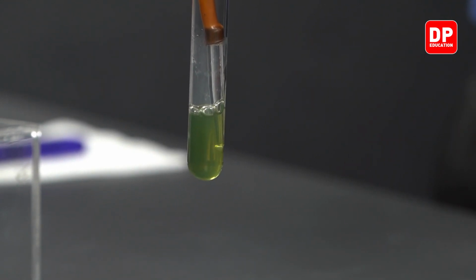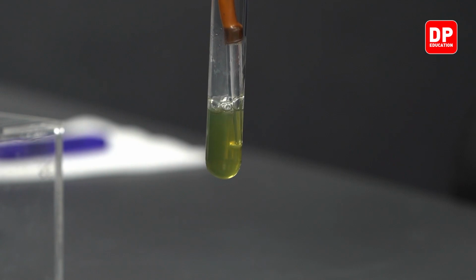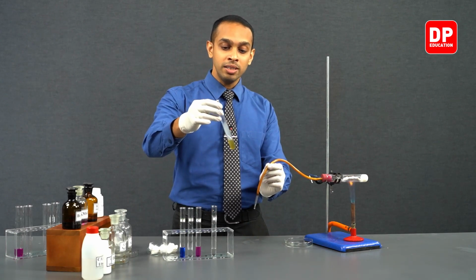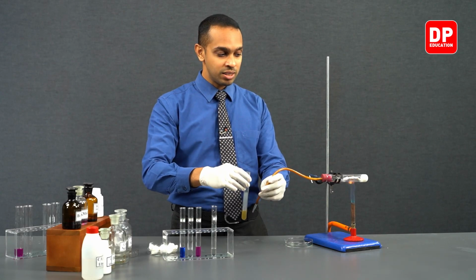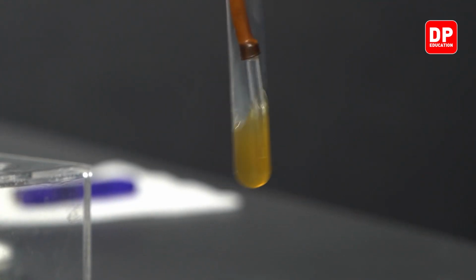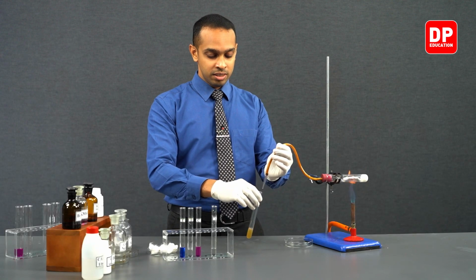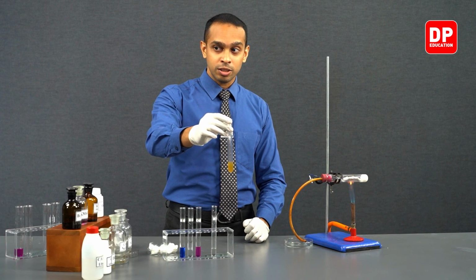This water insoluble precipitate that we have here is going to be suspended in the water as fine particles, and you will observe it like a brown suspension or brown aqueous solution. But you have to keep in mind, it is not a brown aqueous solution. It's in fact a brown suspension. Right, students? So now we have gotten through that point. You can observe that we have formed our brown suspension.